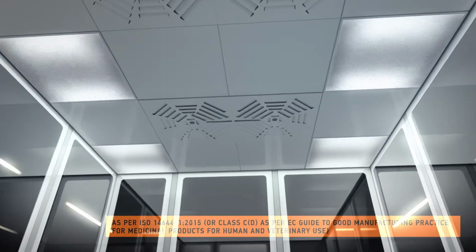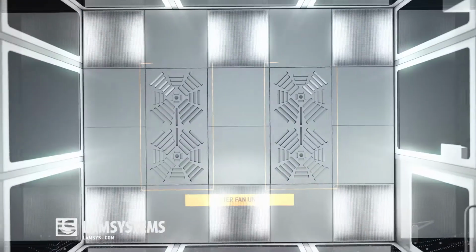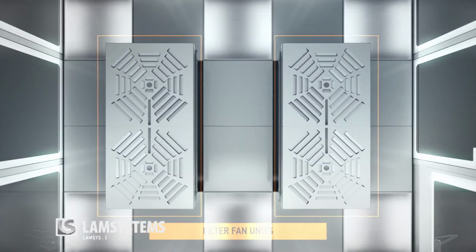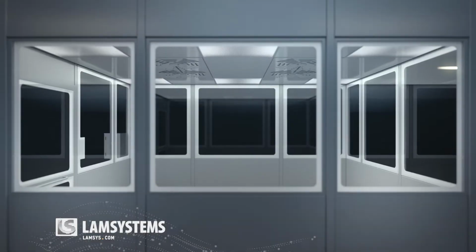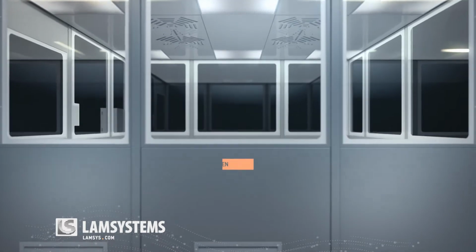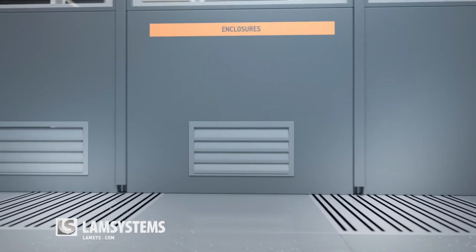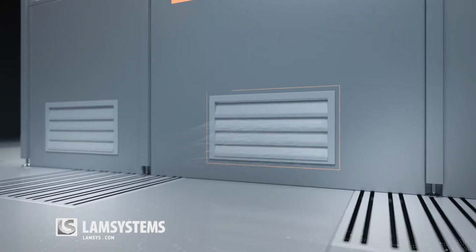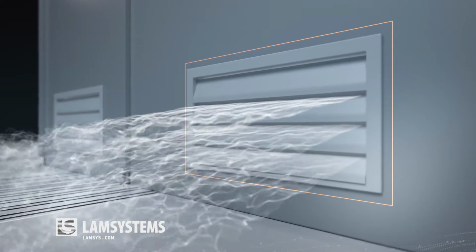The configuration of the ceiling in this case is based on raster principle. Its meshes are equipped with filter fan units and lights. The rest of the area is closed with top panels. The work area is defined with enclosures fixed along the periphery of the clean zone and extended down to the floor level. To ensure positive pressure inside the clean zone, its enclosure is equipped with transfer grids or anemostats.